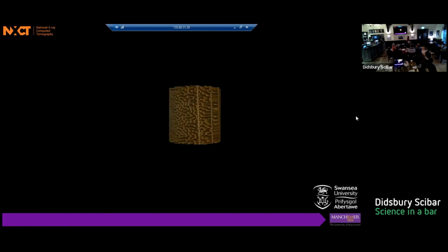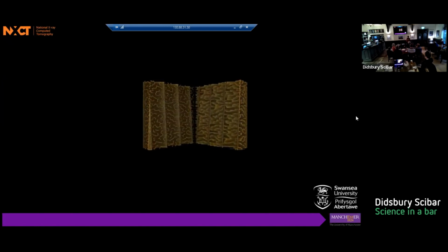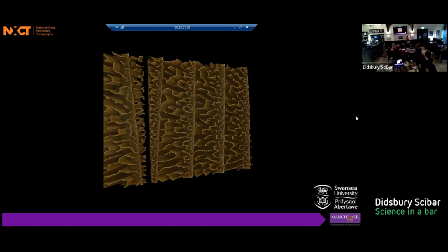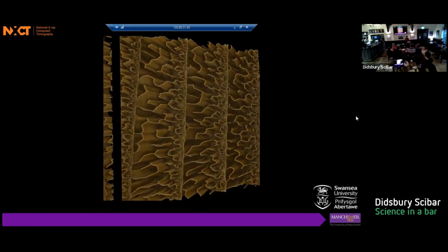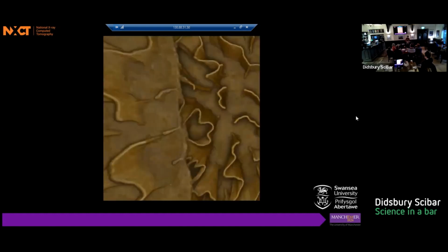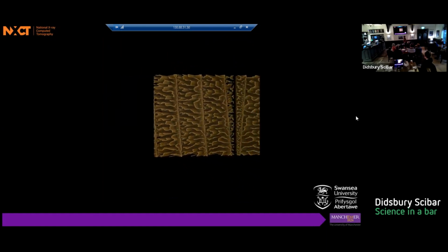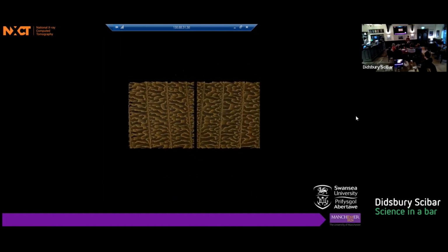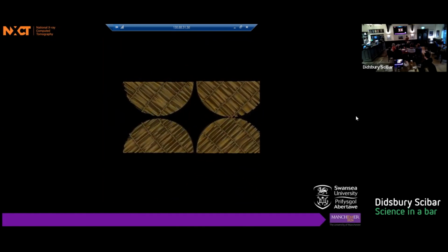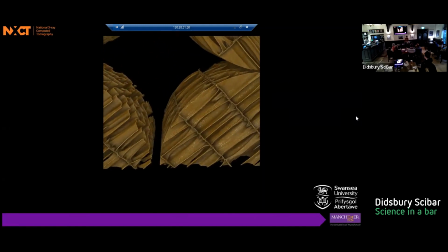So we'll get in a bit closer in a second. So already you can see that it has this incredible labyrinth structure in between layers, and it is literally like floors and rooms. And the question is, well, why does it have this labyrinth structure? And the argument seemed to be from her experiments, including some mechanical testing, that it contributes to the strength. And the way that the cuttlebone actually fails when you put it under compression is a bit like how a building fails during an earthquake. So you will get pancaking, where one floor will fail, and then another floor will fail, and then another, all the way down.